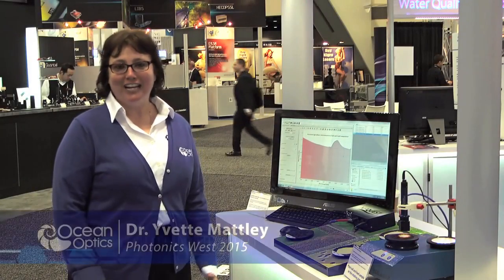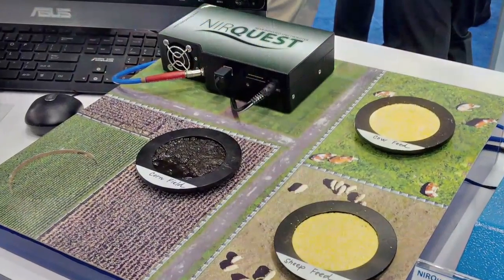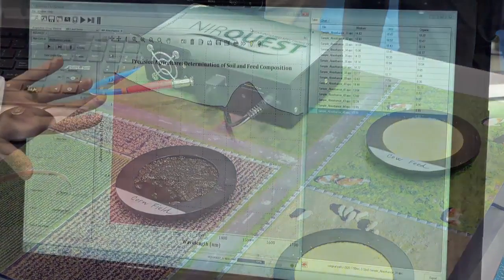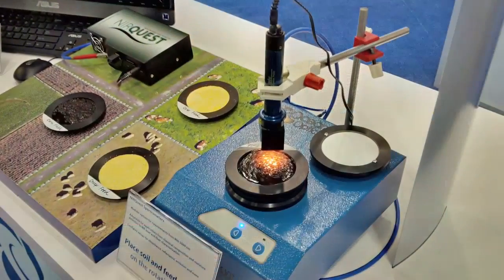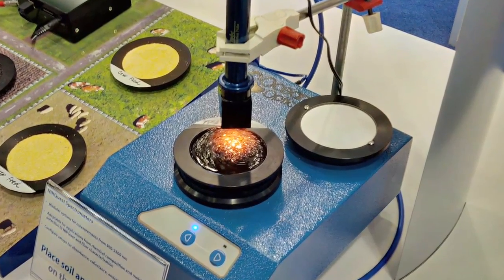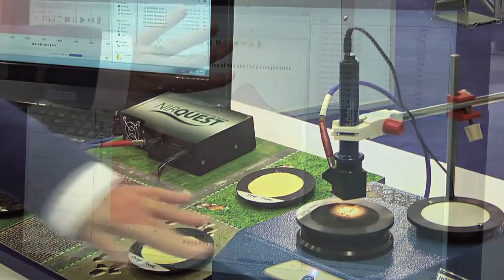Thank you Mike for that great introduction to this demonstration showing how we can use modular spectroscopy in a precision agriculture application. For these measurements we're using our NIRQuest 512-1.7 spectrometer, which is looking at NIR wavelengths from 900 to 1700 nanometers. We're also using our Rotacup sampling accessory, which enables us to get a very representative sample of these real-world heterogeneous samples that we find on a farm.